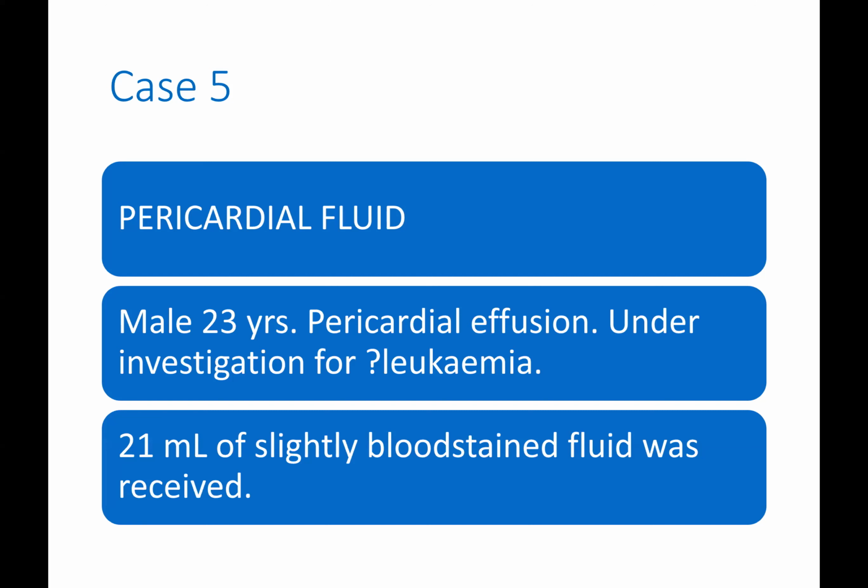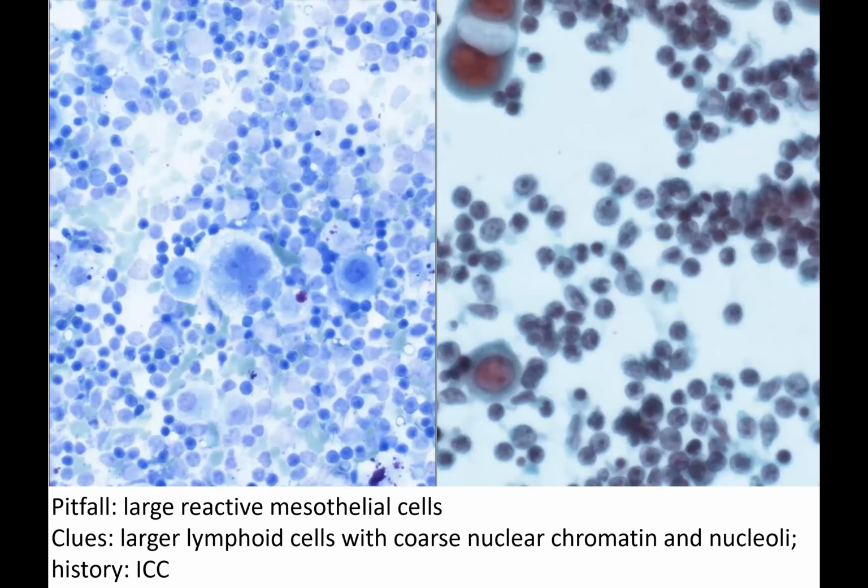And here we have a case of a pericardial fluid from a male of 23 years old with a pericardial effusion. At the time, he was under investigation for a possible leukemia.